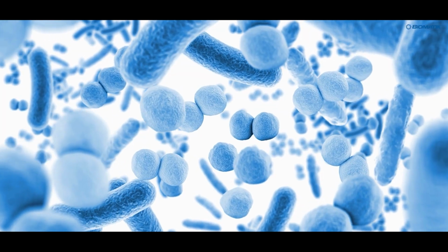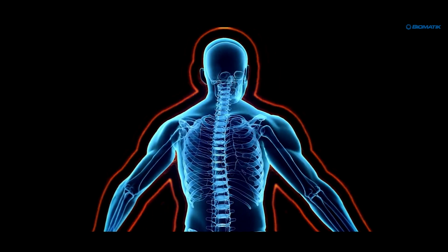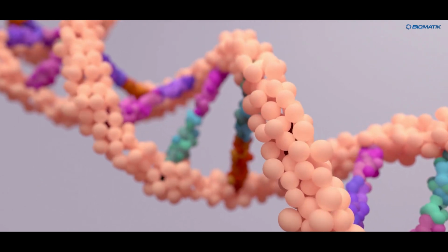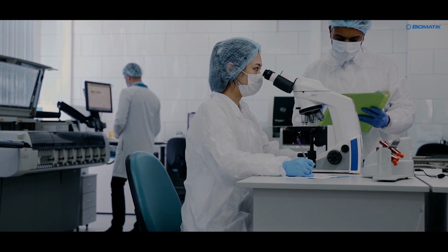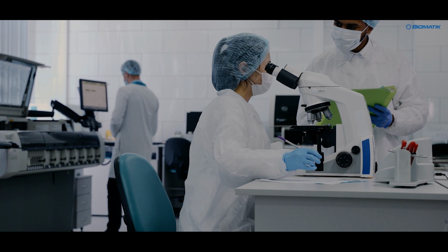Antibodies are essential components of the immune system, combating infection and sickness to keep the body safe. Antibody sequencing is a process of determining the amino acid sequence of an antibody or protein. This helps identify the antibody structure, and allows large-scale recombinant antibody production to produce the antibody on demand, with batch-to-batch quality consistency.